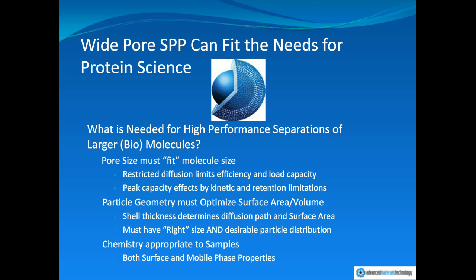If you restrict that diffusion process in any way, you're going to limit efficiency, and you're also, somewhat surprisingly, going to limit load capacity. So peak capacity effects, that is the ability to resolve a complex sample, are also dependent on how exactly you enlarge those pores.